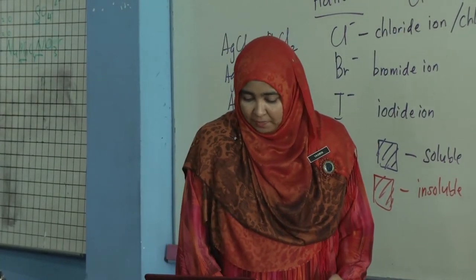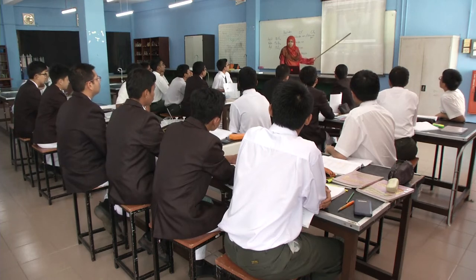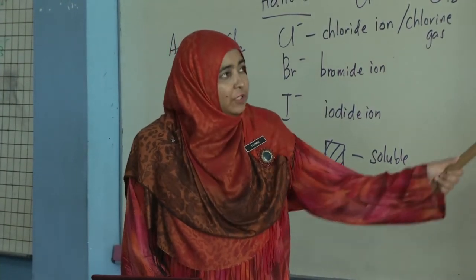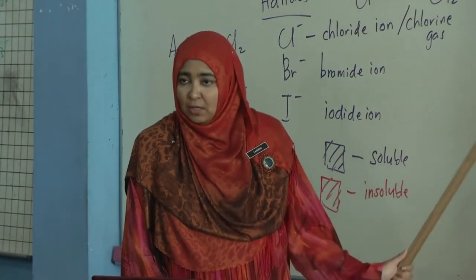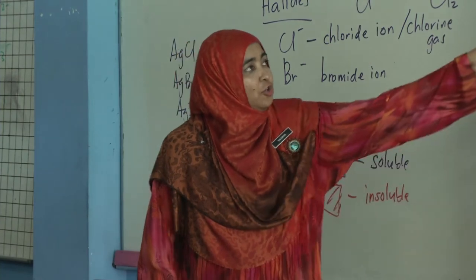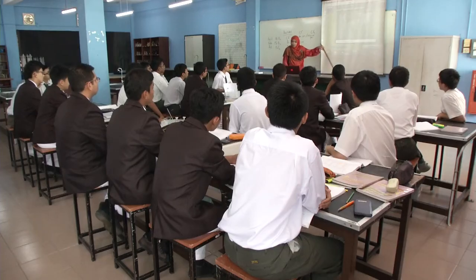After that, once you have gotten your precipitate, you prepare this setup of apparatus. After this, I'm going to show you how to fold the filter paper. So you place your filter funnel in two beakers, and then fold two filter papers, place it inside the filter funnel. Then use your glass rod. What is the function of the glass rod? Is it to stir? No.